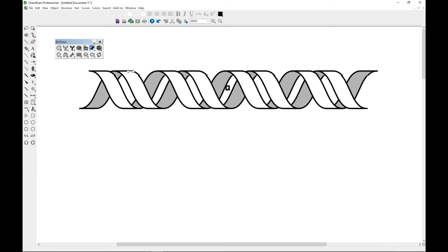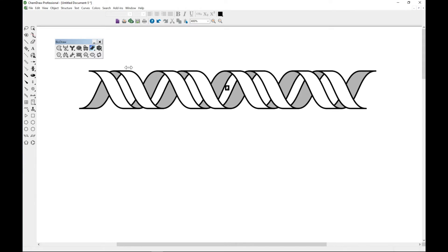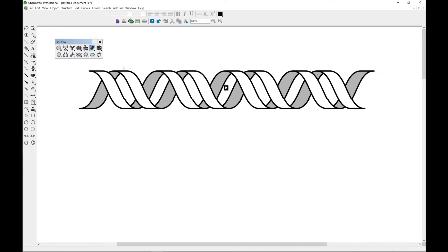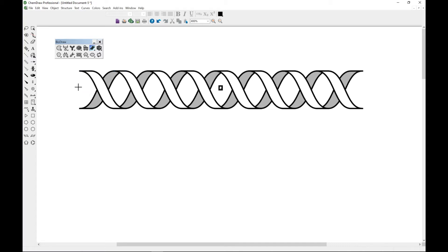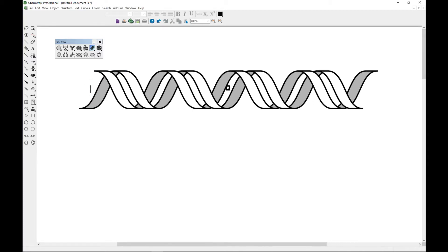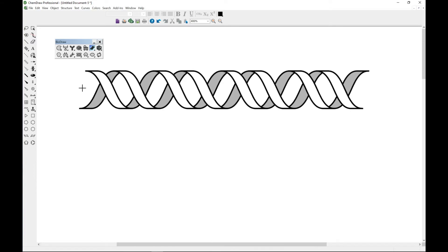You can also do width adjustment, so you can bring it here and change the width. You can also do offset adjustment, so you can come back to the side and do offset adjustment. That is something important to note using DNA.